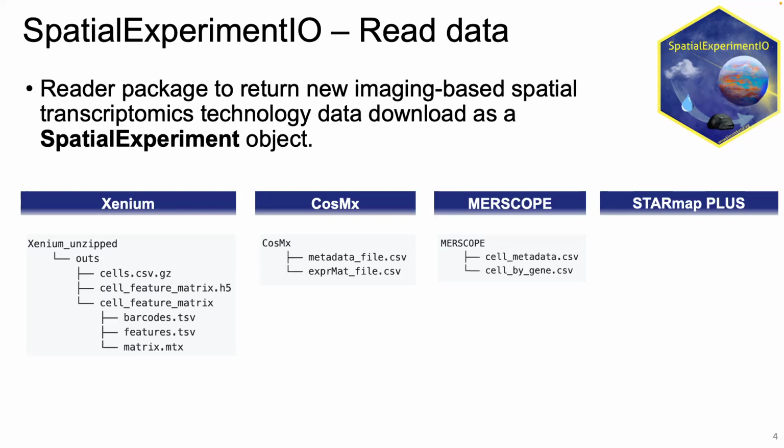And later on, Dario will submit a pull request to include the polygons without the transcript-level details, because as statisticians, usually what we care about are the units at the cell level. So currently there are 4 technologies, and I added one last week, SeqFISH, by a pull request. So yeah, this will continuously grow as we have more and more spatial technologies.